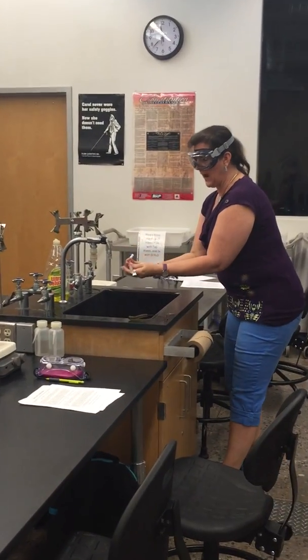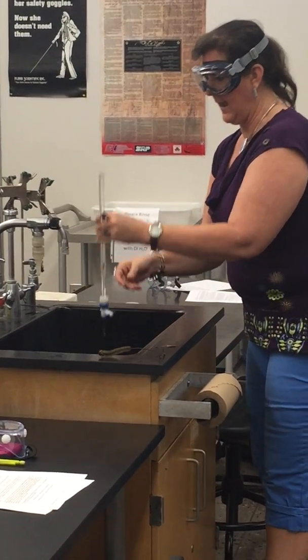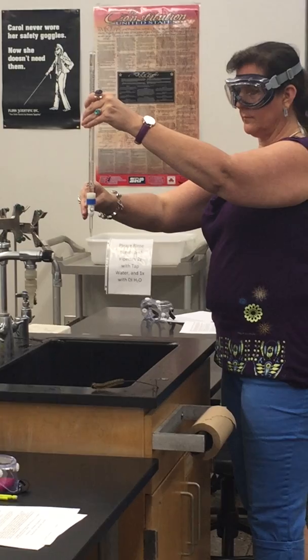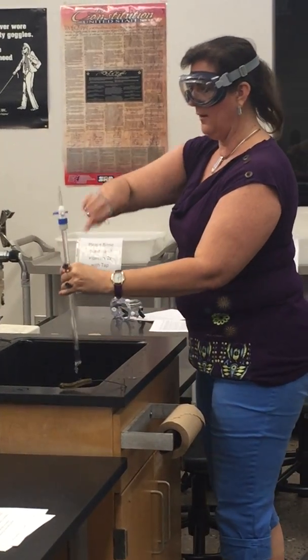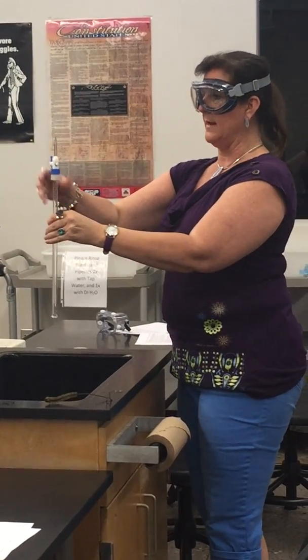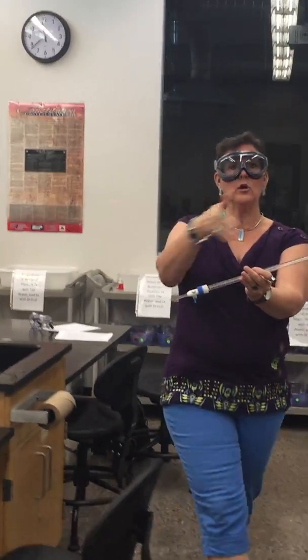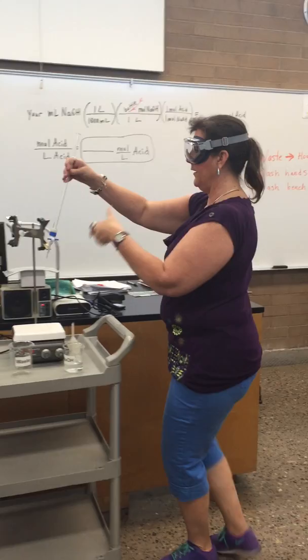Now we're going to go back to the sink because we're rinsing it with sodium hydroxide. We're going to hold it sideways, roll it around, and let it come out through the tip. Then turn it upside down, open it up, and let it come all the way out. Now it's empty.